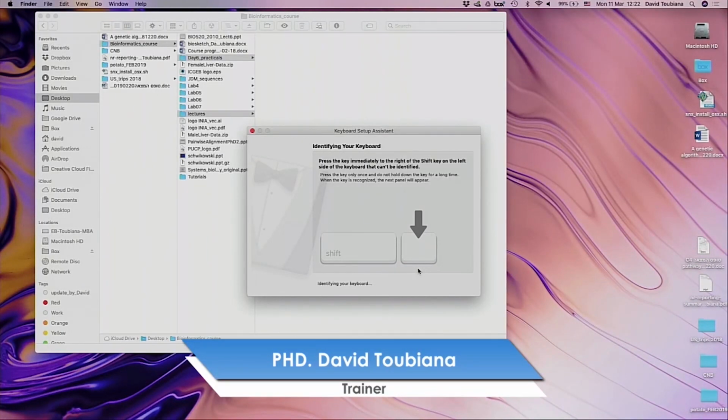Okay. So apparently there is a new version of it called vSearch that I'm not aware of, but it works the same. So if some of you have problems installing that on Windows, maybe you can try vSearch instead of USearch. If that's not going to work, then we need to somehow use it on our Linux distribution, the Biolinux that we have. Okay, so while you're copying, let me say a few words not regarding USearch.